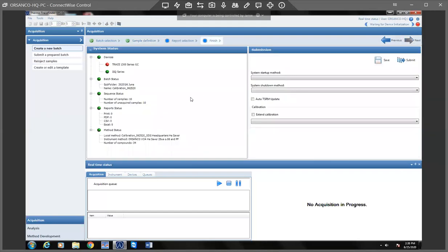And if you watched the previous video, you'll see that my GC is not working right now. So this should be green. When you get to this stage, you do want to make sure that all of these are green circles here. And also up here would be green. So right now they're not, but that's okay. We're not going to actually run this.